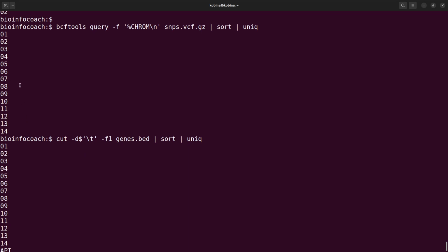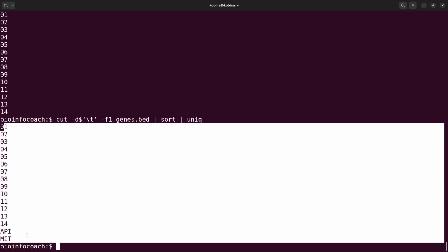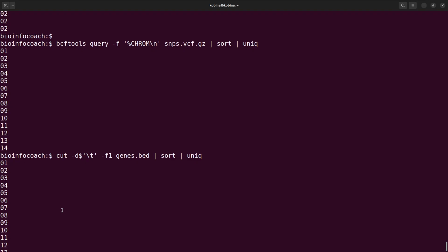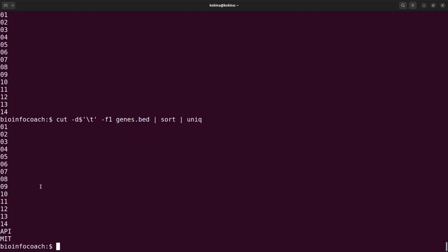Whatever is in the VCF file should be in the bed file, if you want to get accurate information. Or let's say, put the information that you want to be added to the VCF file in the bed file.